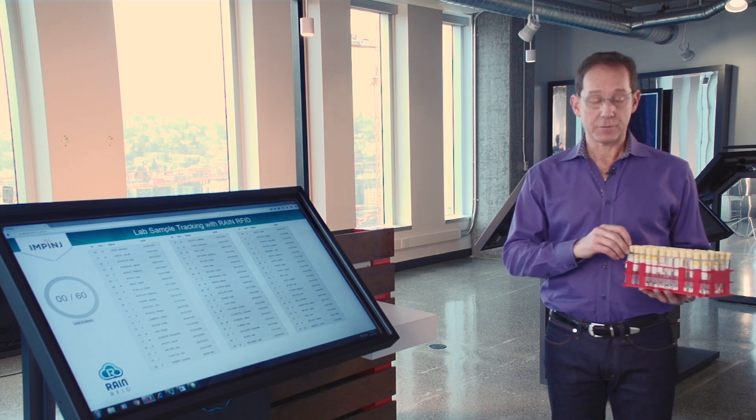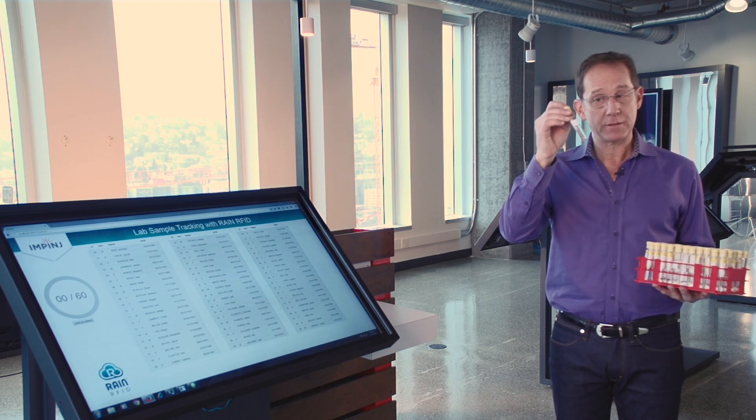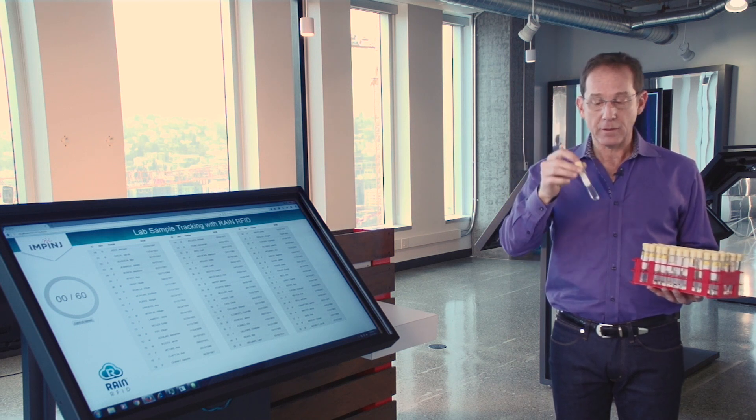Our RAIN RFID can solve some of those problems. So what we're showing here is a very small RAIN RFID tag powered by an Impinj Monza IC on that little sticker right there.